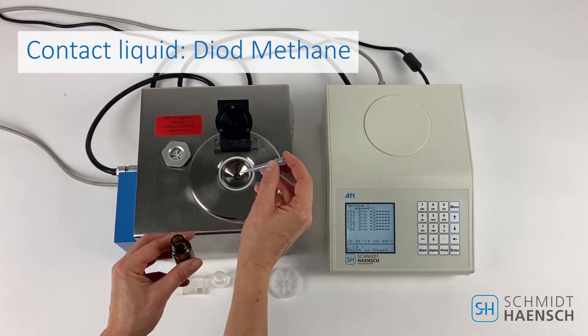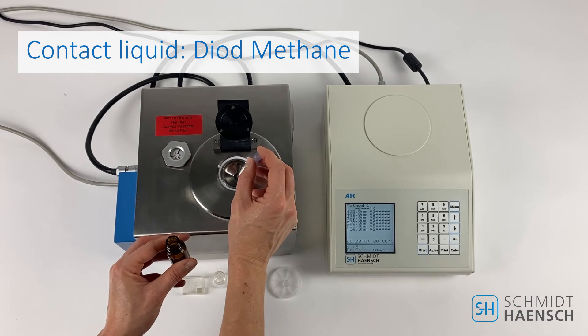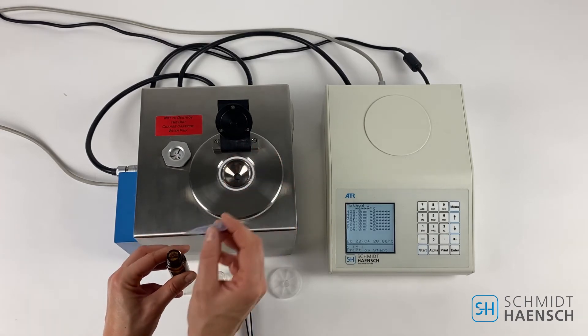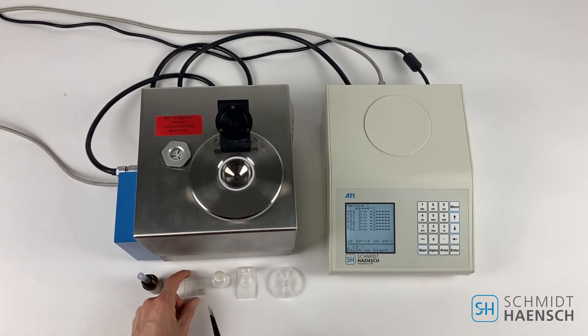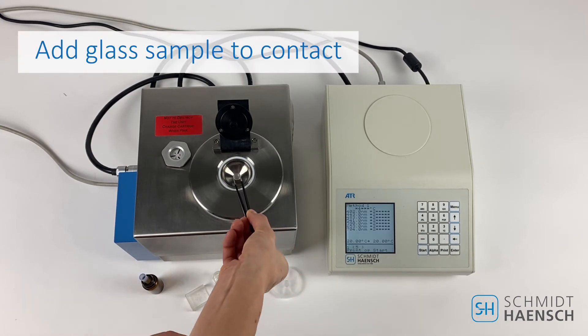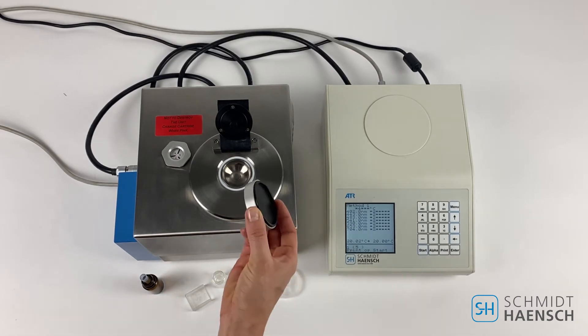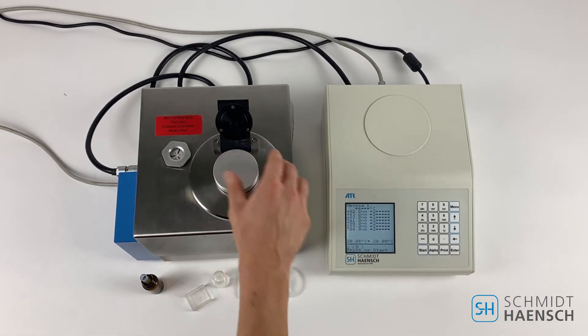In order to get rid of the reflection of the upper surface we will apply another drop of liquid on top of the polymer sample. We will also apply the glass sample to contact the polymer foil. Then again close the lid.